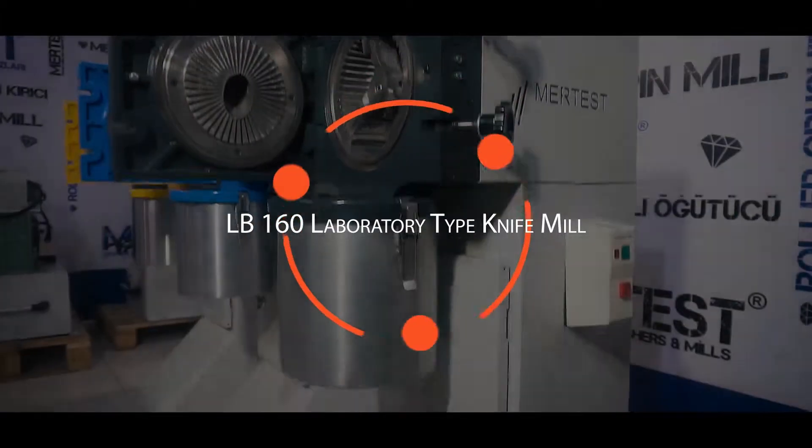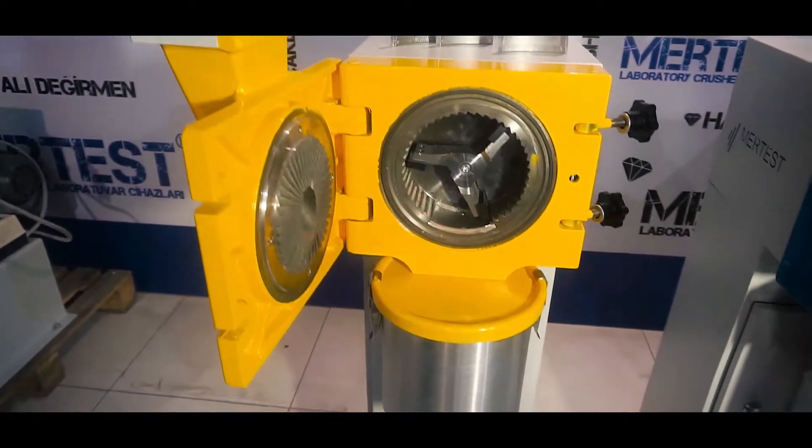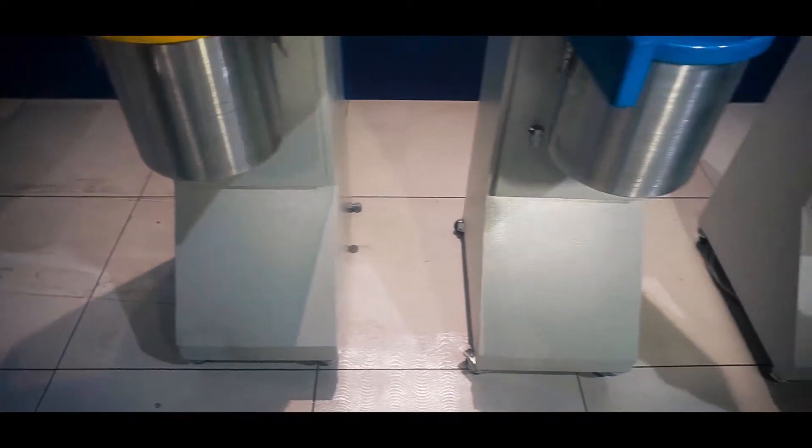With its compact structure, easy operation, micronized grinding and granule crushing, the LB160 Blades Mill is the preferred product.